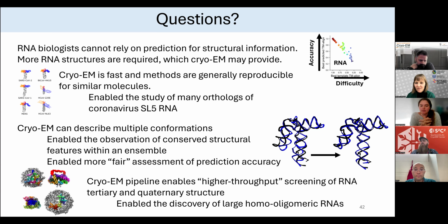So I'd say the goal in these kinds of structure determinations, as opposed to solving the structure, is to outline what parts of the structure we can be confident in, right? So, for example, for the viral RNAs, we know for two of them that there is a tertiary interaction there, but it was not resolved in sufficient resolution for us to tell you what it was, right?